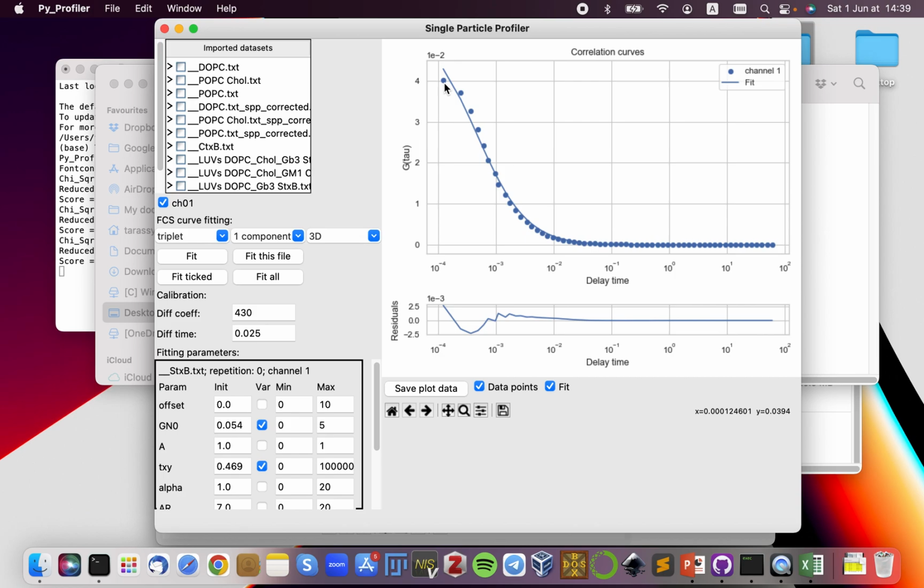Maybe if you want to have better resolution over here, you should select smaller time step in your spot SPP. Yeah, by the way, I have made the recordings on how to record spot SPP. The description also contains the link to that video.